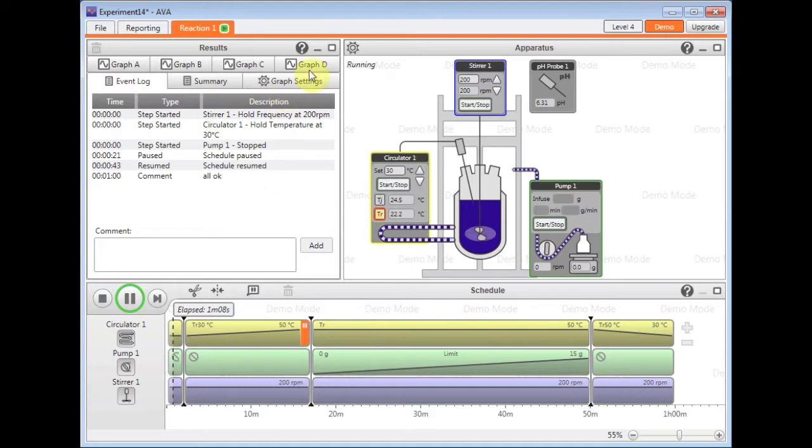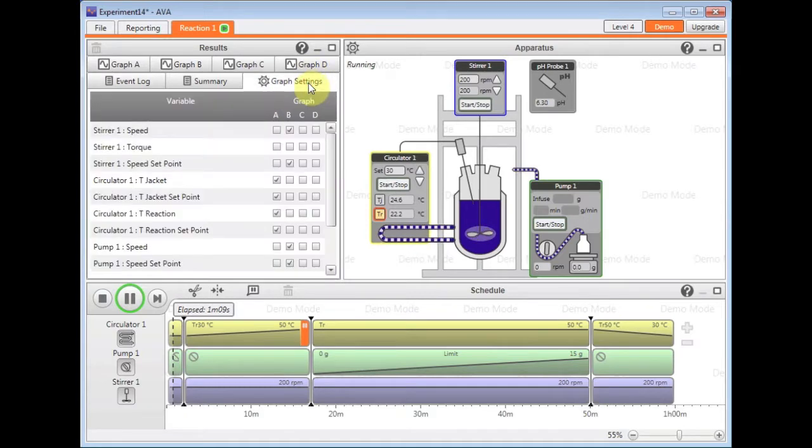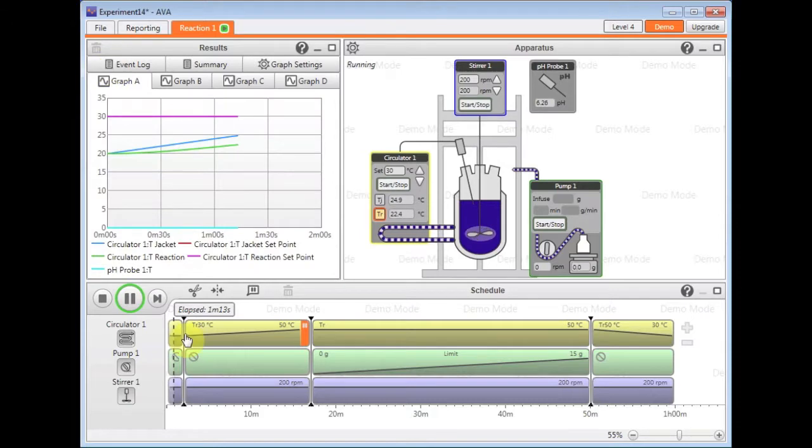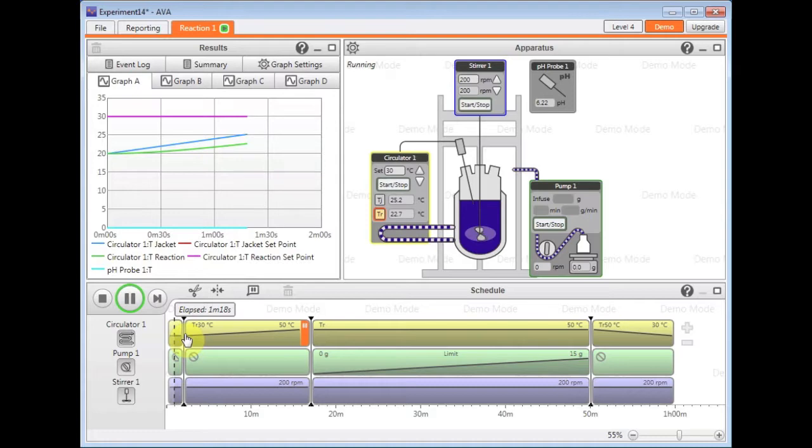You can also configure your graph views and see whatever you like on each of the graphs. So for example, you want to see the reaction temperature in relationship to your addition, then you can do so.